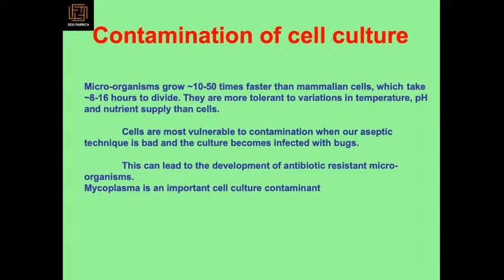When we were doing experiments, we did mycoplasma tests regularly, every 2 or 3 weeks. And we tended to find them in our cell cultures. Even if your cell culture looks plain, if people do not handle it the right way and you put it in the incubator overnight, all the other cell cultures end up being wasted.